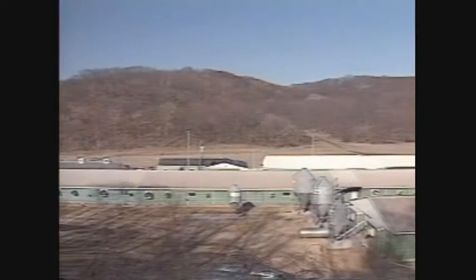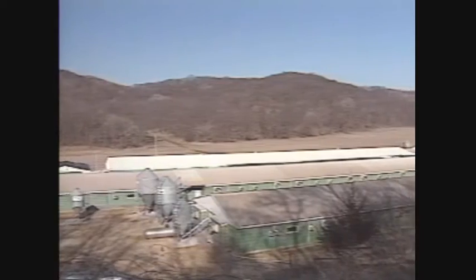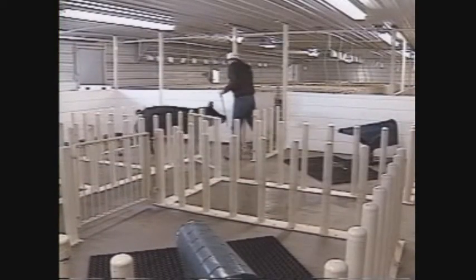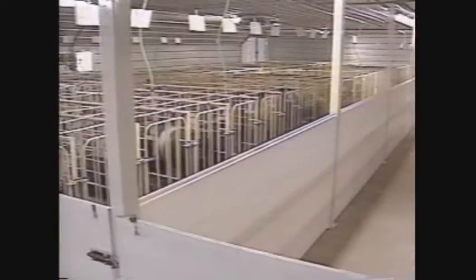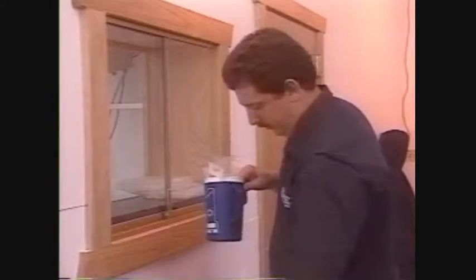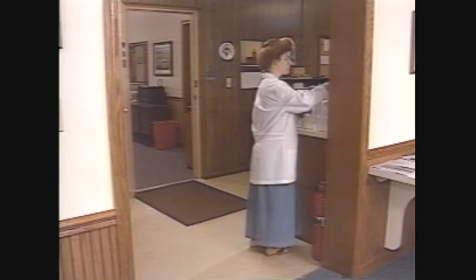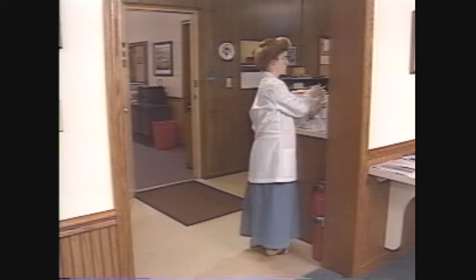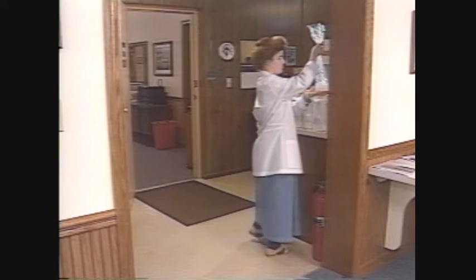The number of pens will depend upon the size of the stud, staffing levels, and the daily workload. In practice, one collection pen for each collector individually working simultaneously is sufficient. The pen should be positioned in the stud to provide for ease of movement of boars to and from after the collection. The semen should be protected from cold shock throughout the journey by packing into an insulated box or vessel. Placing a container of warm water in the transport box can help maintain temperature.